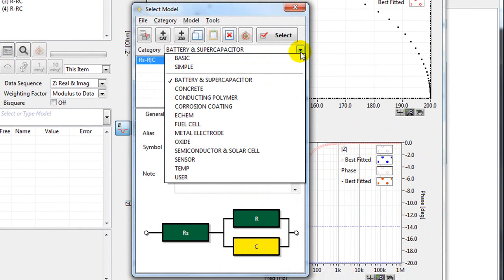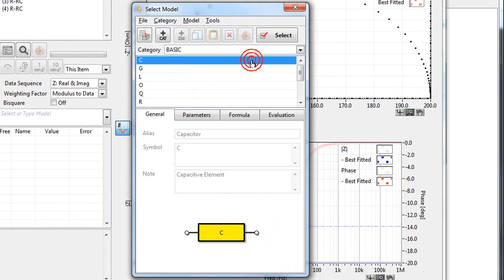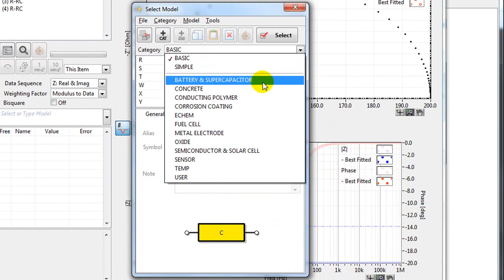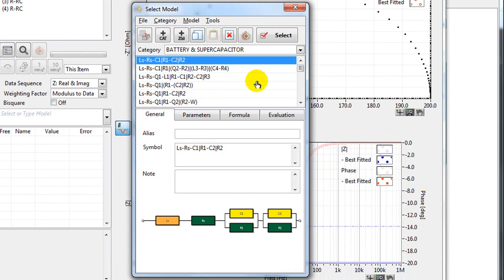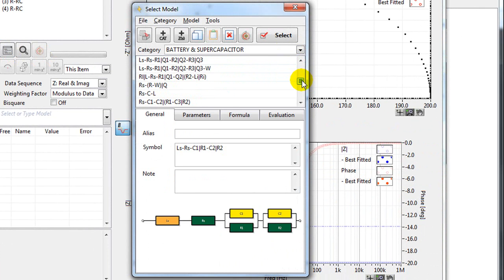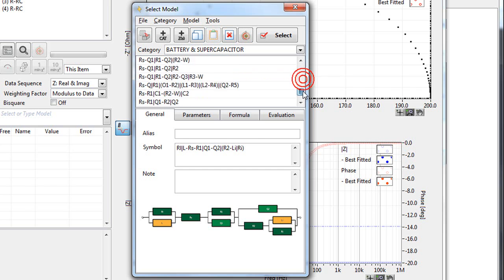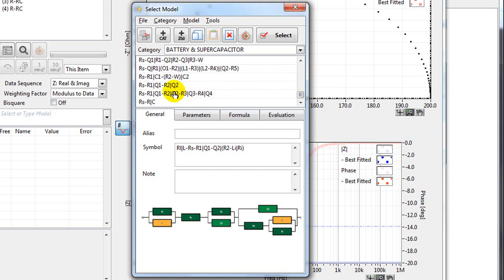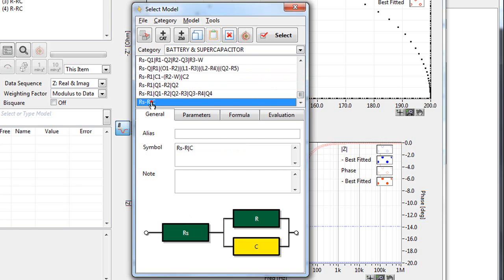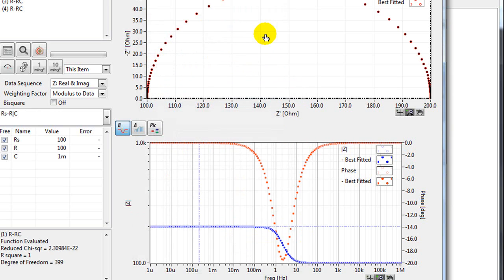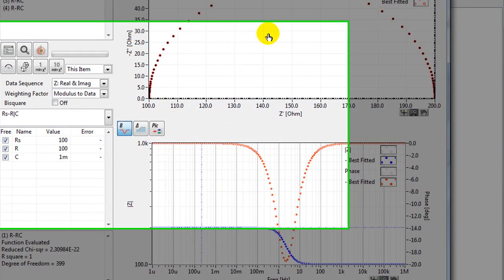It's comprised of different categories. So basic categories, battery and supercapacitors, and has a whole list of different models. It shows you the model here. For this data, I'm going to use this model down here. Click select.